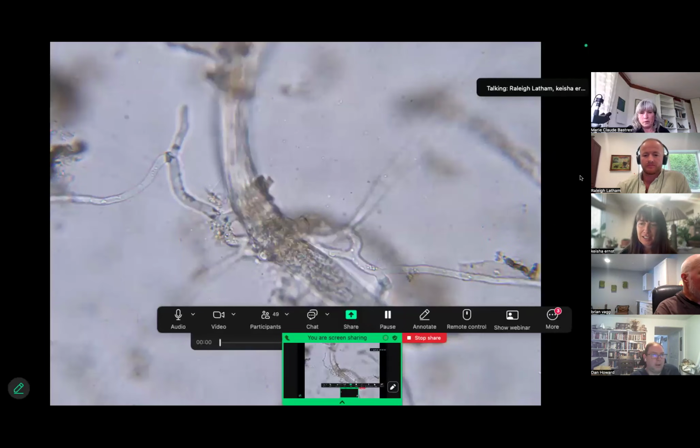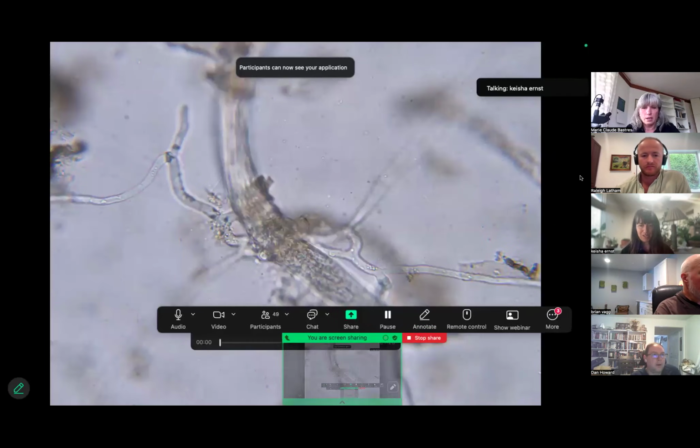Great. Do we want to look at that video? Let's do it. Let's check it out, the nematode-trapping fungi. And then when Marie gets that video, I got some great nematode stuff to show you guys after that too.